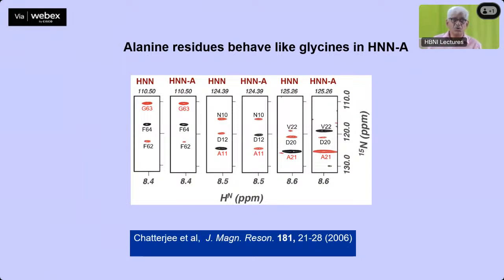In the corresponding orthogonal cross-section, the F2, F3 cross-section, you again see the same three correlations of a particular set of residues, I minus 1 and I plus 1, but now displayed in the form of an HSQC. Therefore we call the F2, F3 plane the triplet filter through the HSQC spectrum. So you get the NH proton chemical shifts and the N15 chemical shifts of the three consecutive residues, I minus 1, I and I plus 1.